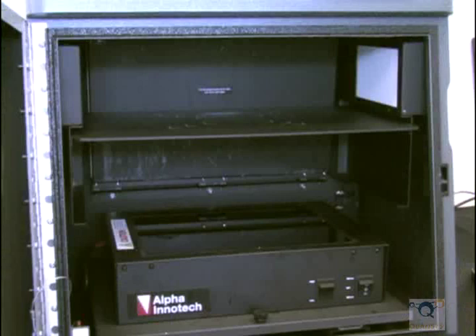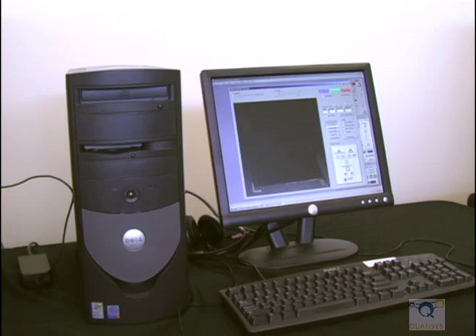Place the plate in the center of the tray and make sure it is in the center of the photo path on the computer screen.